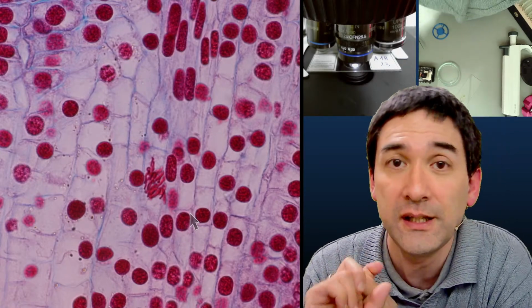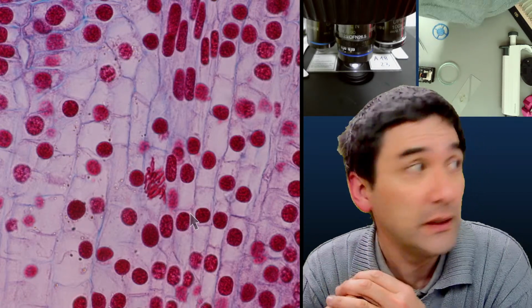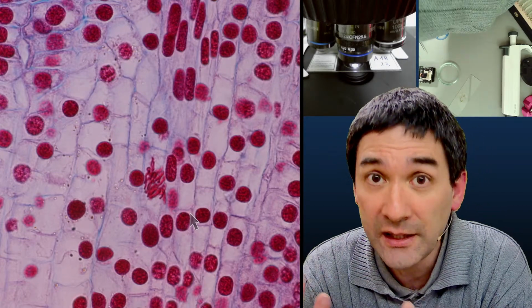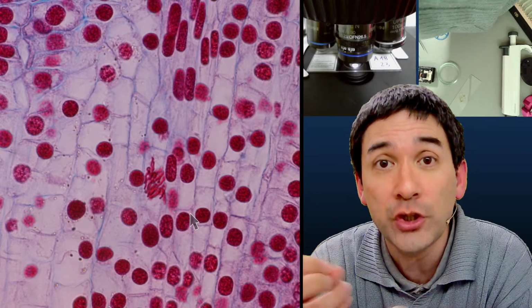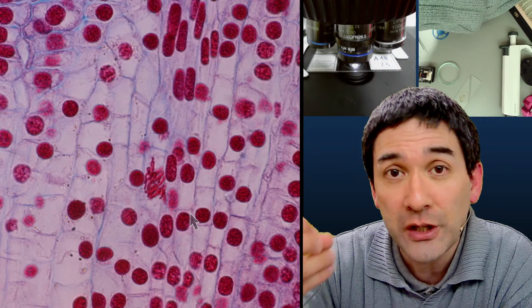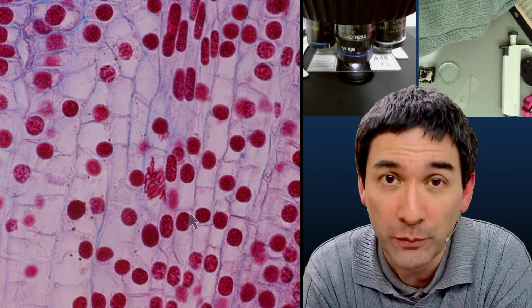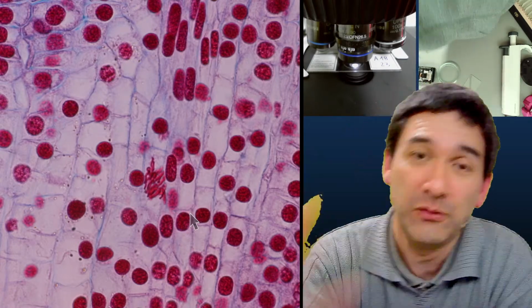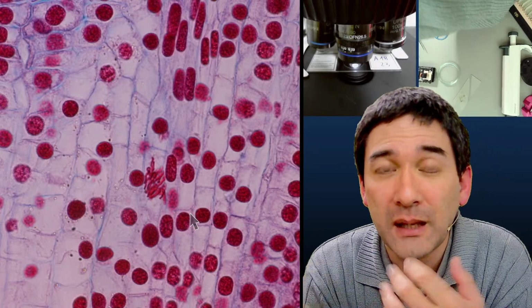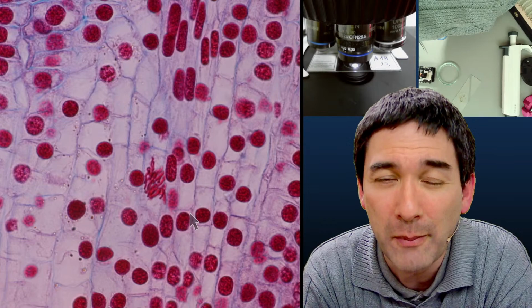Second possibility is you try to connect a webcam directly, or if you have a DSLR like I have, like a Canon or Nikon DSLR, then they have an HDMI out. And this HDMI out can be connected directly into a monitor without the need of a computer. So that's kind of convenient as well, to not have a computer. You just use it directly. Sometimes the image quality is not so high because it depends a little bit on the quality of the HDMI signal.